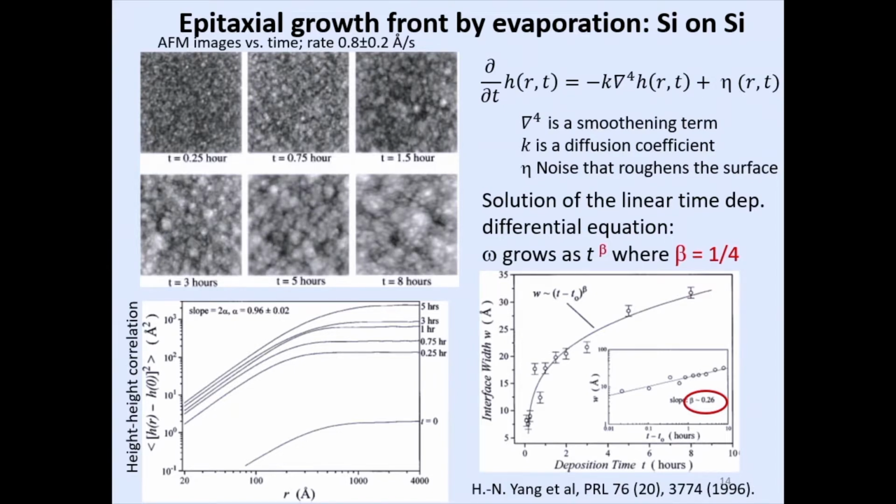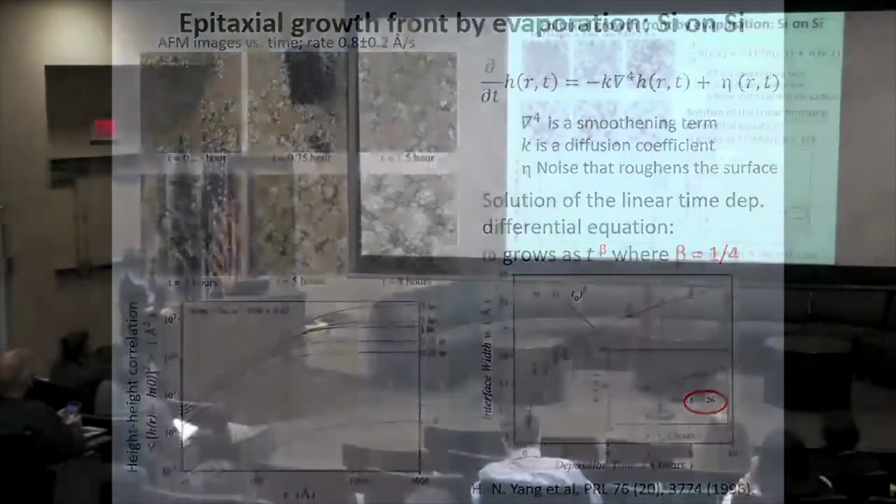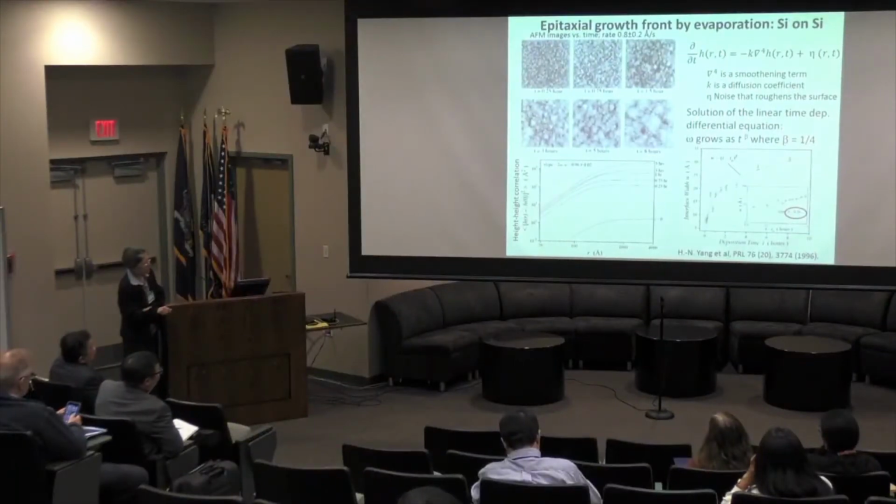Okay, a quarter of an hour, you got this curve. As time goes by, you got this curve. But locally, the curves seem parallel to each other. It means local roughness doesn't change a lot. But if you look at the vertical roughness, it increases. Also, the lateral correlation feature also increases a little bit.